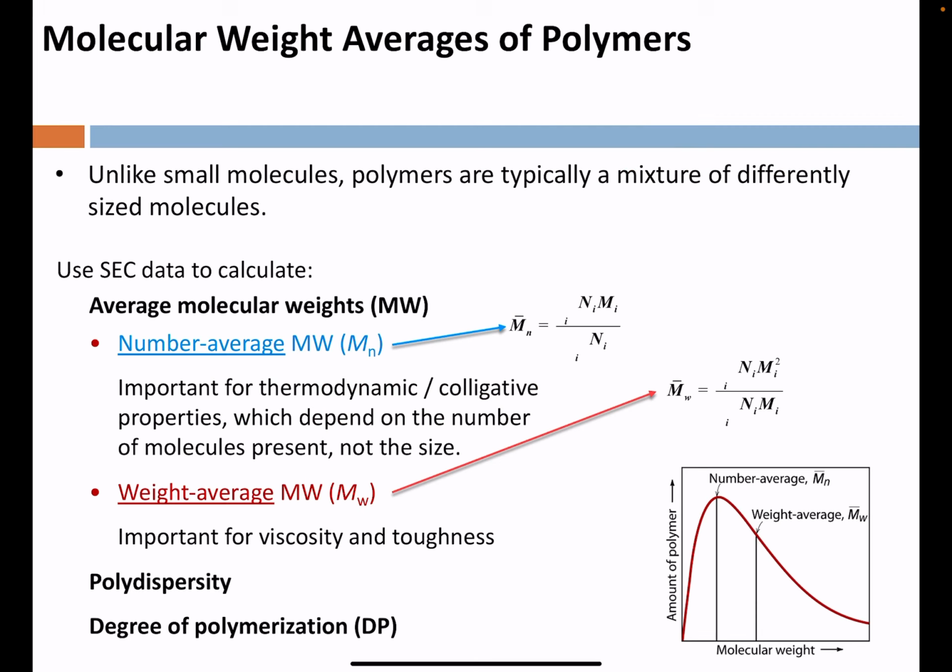So what we know here about molecular weight and profiles of all synthetic polymers is that they have a mixture of differently sized molecules present. Only in rare cases, like in biology, can there exist one molecule for a polymer that is at the exact molecular weight known. Synthetic polymers have a mixture of these different size molecules.